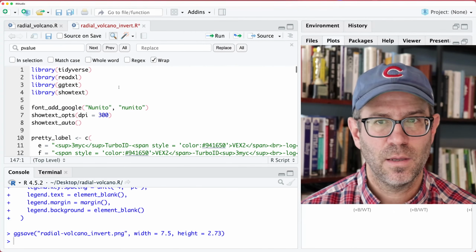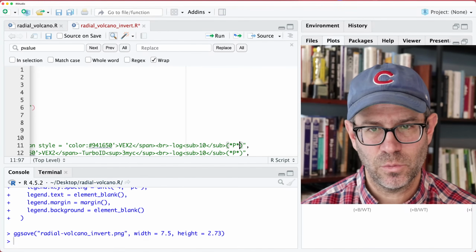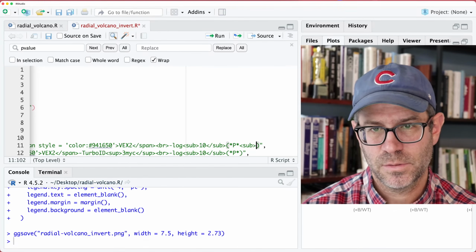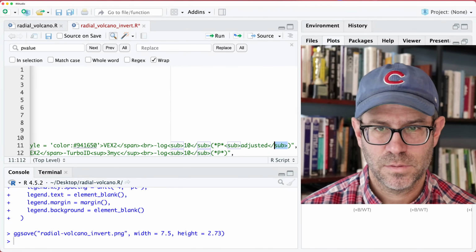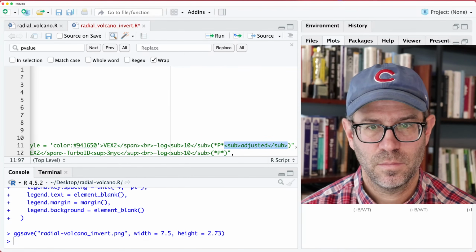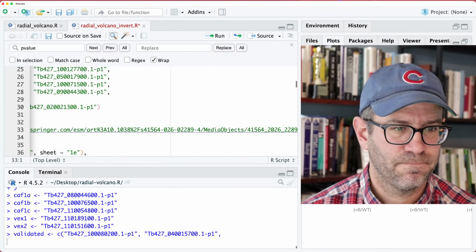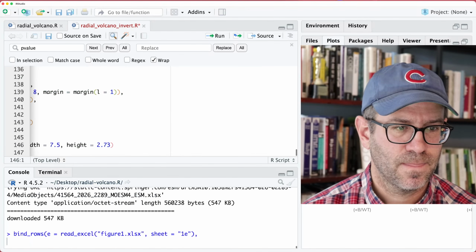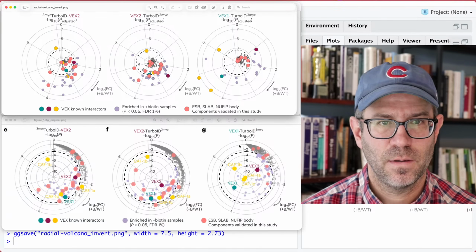And so maybe I could come back up here and then do sub adjusted, sub, let's see.